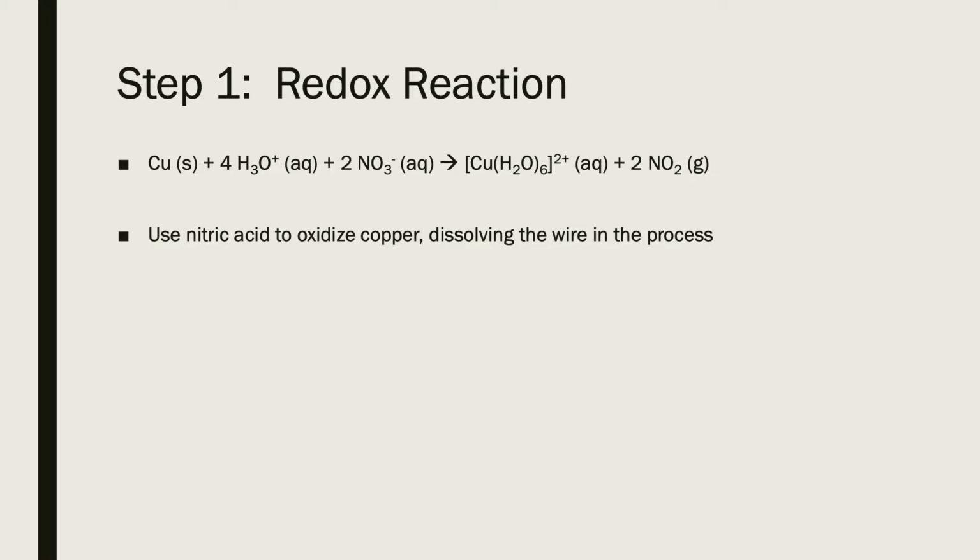But we do want to be cautious here because there are a couple of things to pay attention to. First, we are going to be using concentrated nitric acid for this step, so be careful handling it. We're not using very much, but if you do get nitric acid on your bare skin, you will feel it. It will burn a little bit. It'll probably even turn your skin a little yellow if you get some on you, so you will know if it happens.